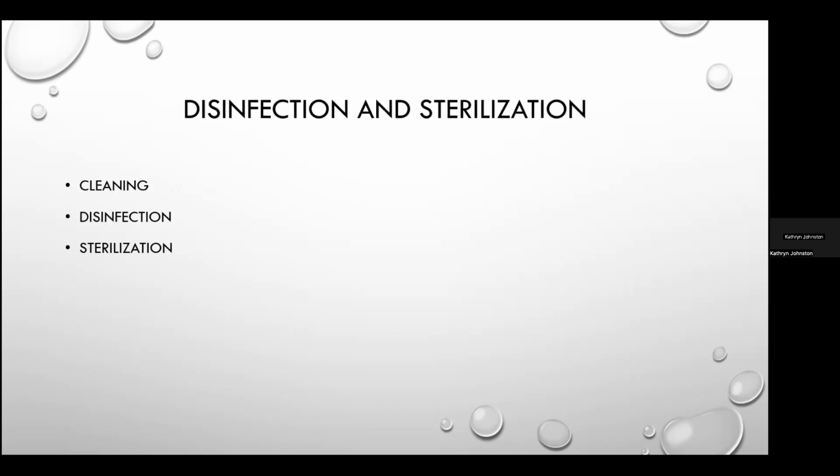So I'm going to go over this briefly. This is a little bit more detail though than what I did in the first part under standard precautions. We're going to talk about cleaning, disinfection, and sterilization here. So back to the basics. What exactly is cleaning? Cleaning is the first and most essential step before any process of disinfection or sterilization can be carried out. And again, with the caveat that in the laboratory, it's backwards to this. They don't recommend cleaning prior to disinfection or inactivation of the pathological agents.